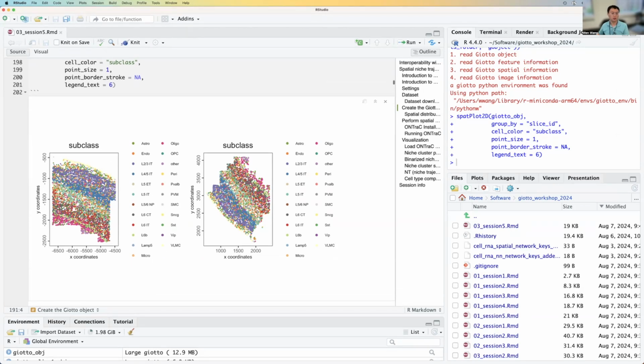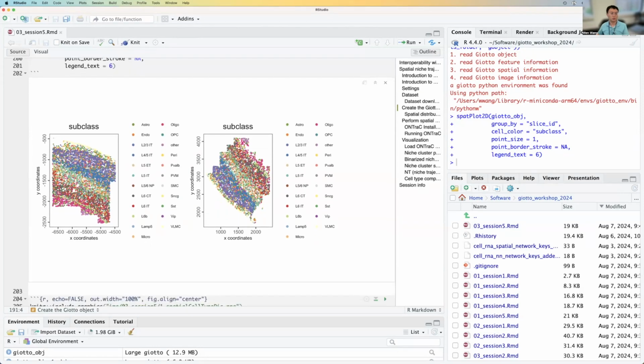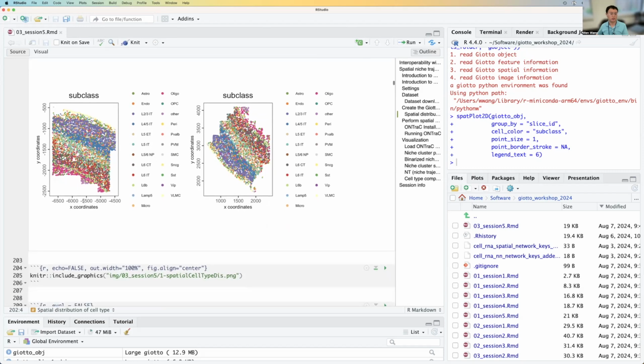It should be mentioned that this is a mouse brain dataset, and the VLMC is annotated at the boundary of this brain, going to the deeper layers. So there exists a natural coordinate here that goes from the boundary to these deep layers.